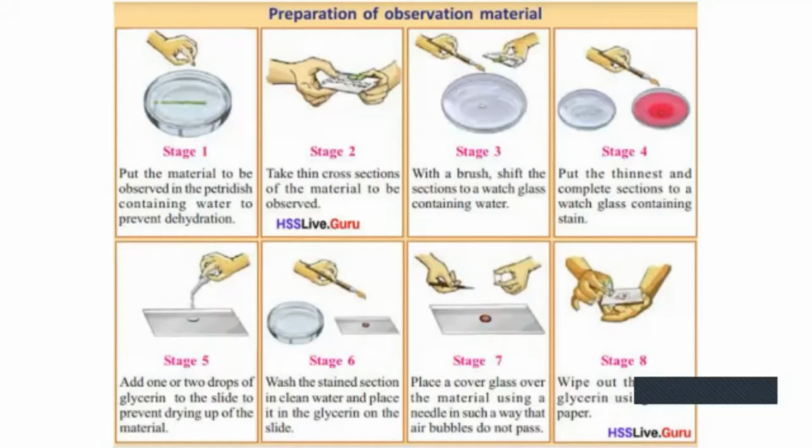Then after that, place a cover glass over the material. Cover glass is a square shaped thin glass material. Okay, so place a cover glass over the material using a needle in such a way that air bubbles do not pass.